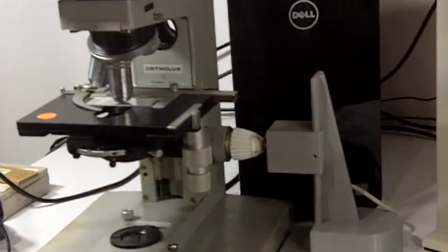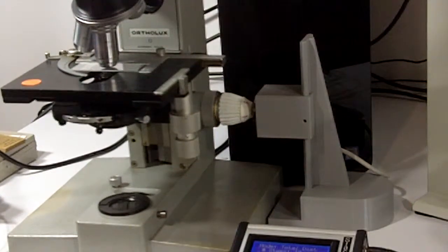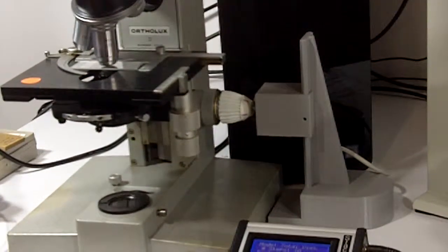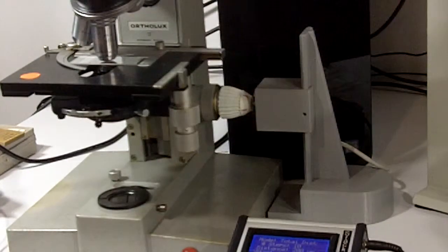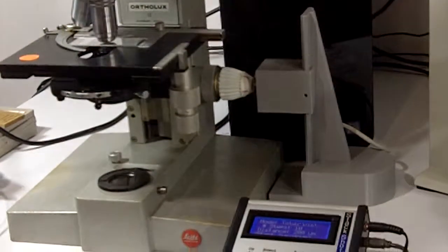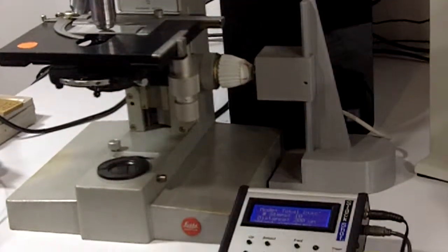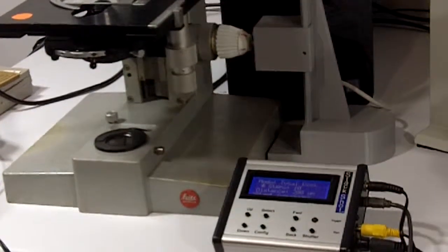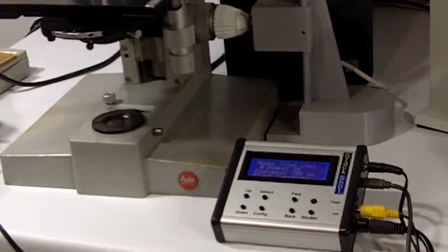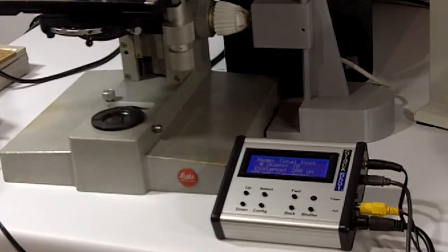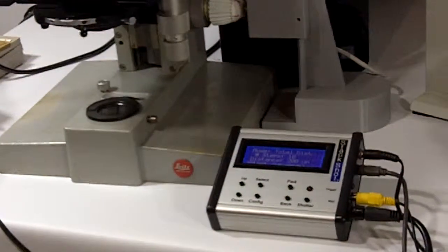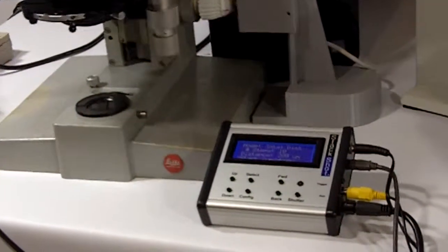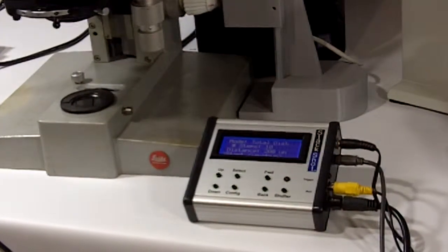Here's our 3D printed pedestal stand with the gripper cup mounted to the fine focus, and the other component that comes with the Retro Zed is the famous Cognosys StackShot. Here you'll see the basic control unit with the four connections on the side.